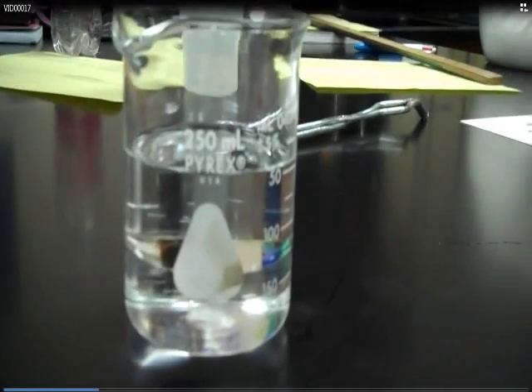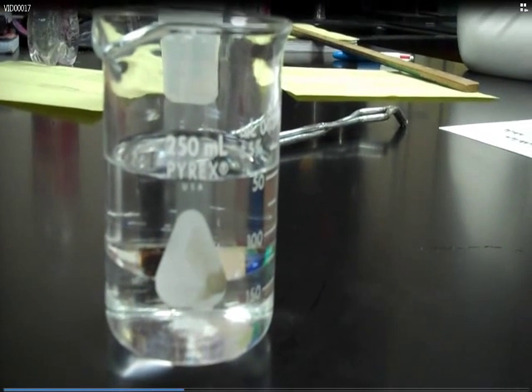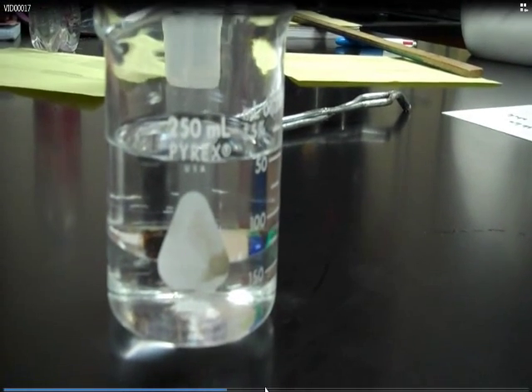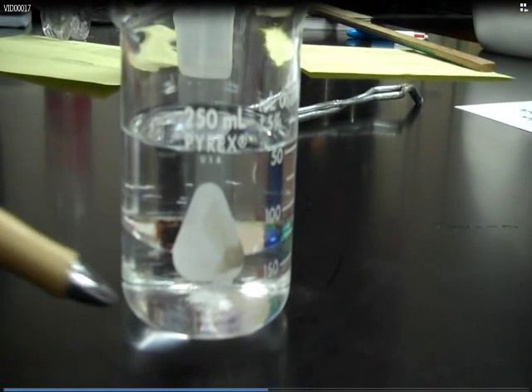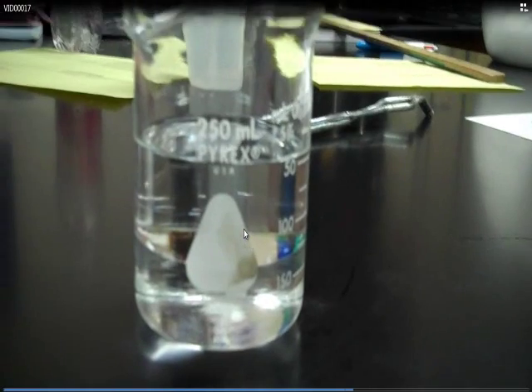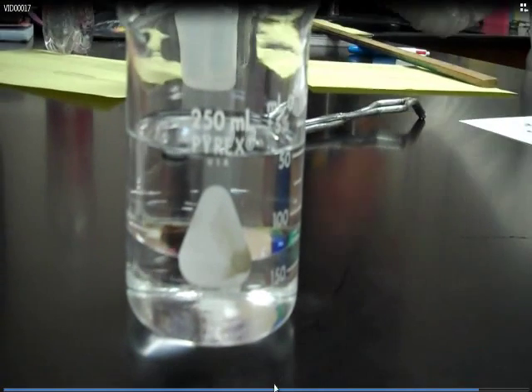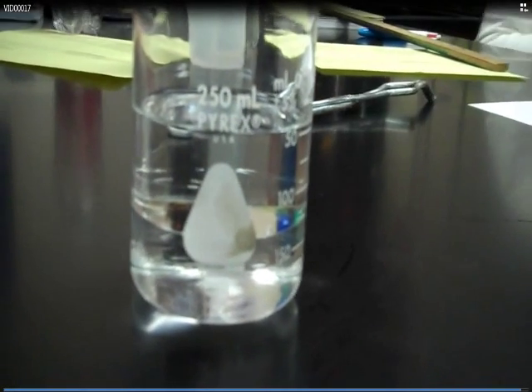Now here in a beaker, which Mason is pointing at, we have water and hexane. Hexane is nonpolar, water is polar. At this point in time, we do not know which layer is which. So we're going to add something to our mixture. We're going to add iodine crystals.